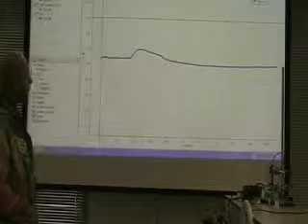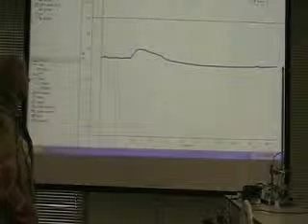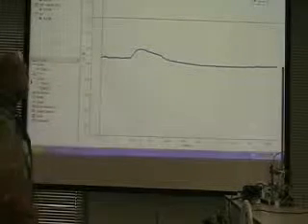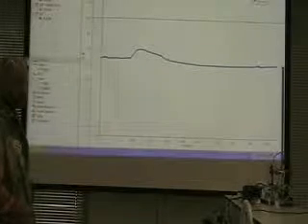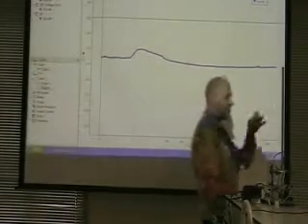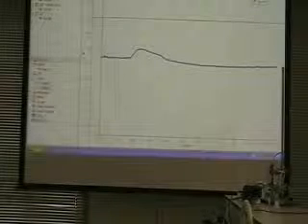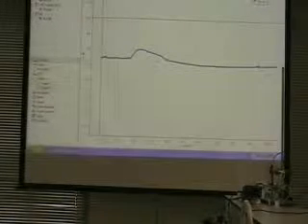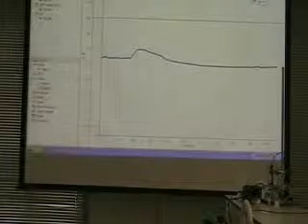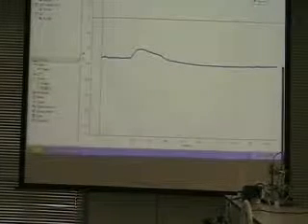For a while there, it looked like it was doing pretty much what we thought it should do, right? pH was rising. Then it hit a plateau at -1, which is already theoretically impossible, and then begins to go down. Now the reason for that is that the pH probe has a glass vial in it, and what it's actually measuring is ions moving back and forth across that glass. And as those ions go, it gives an electrical current, and it's measuring that current directly. So anything that messes with that current messes with the pH reading.